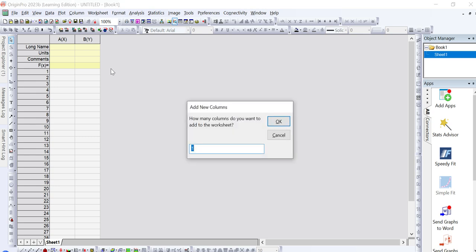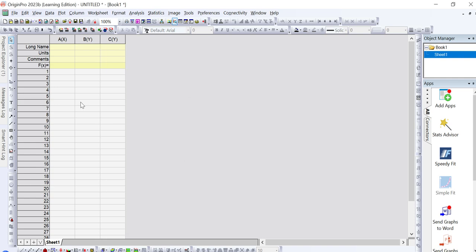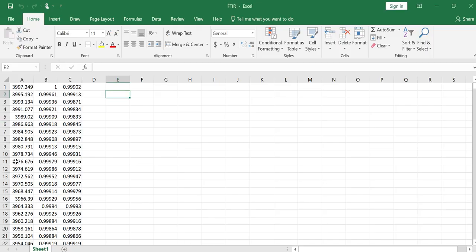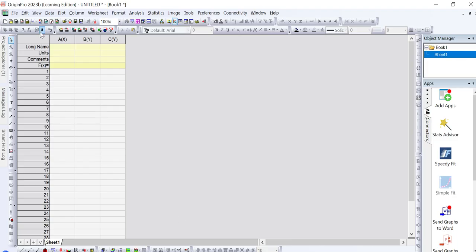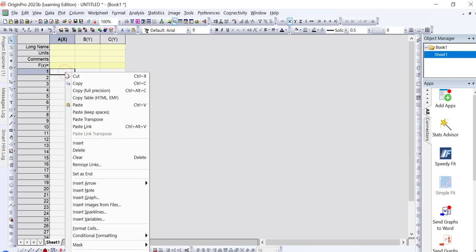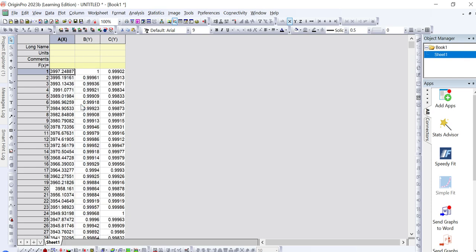If there is no third column, press Ctrl+T and it will ask how many columns you want to add to the worksheet. Click Enter to add one more column. Then select your FTIR data using Ctrl+C and paste it into OriginPro starting from where the numerical values begin. You can paste by right-clicking and selecting Paste, or using Ctrl+V.